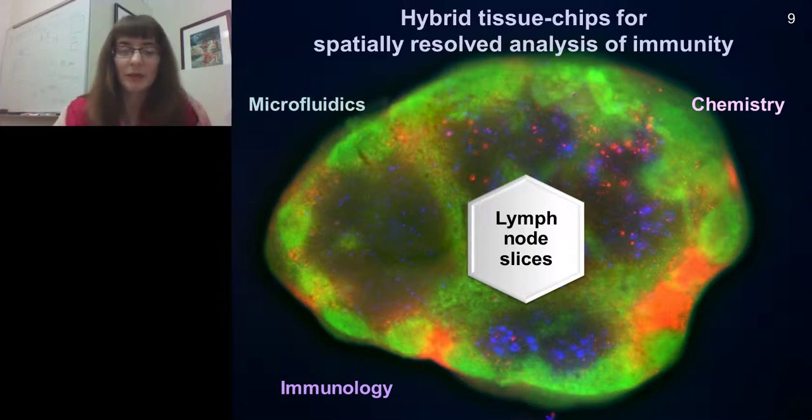And so by combining microfluidics and chemistry and immunology, we hope to develop new tools so that we can ask questions about how your immune system is organized and how that drives the spatial effects or how that drives the response in an immune event.